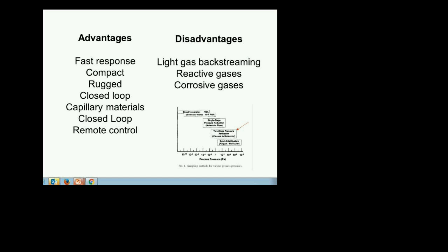And in between, you can introduce a little bit of nitrogen to a known pressure in your ion gauge and make sure that you're not losing a lot of sensitivity. I have that. The RGA that I have in my lab right now started with a sensitivity of 2.2 E minus 4, and right now I'm at about 5 E minus 5. That doesn't mean that I'm going to take it apart or do anything exceptional. I just recalibrate the sensitivity and life goes on, because I don't need the sensitivity at the low end.